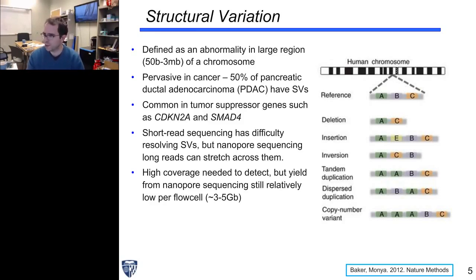Short read sequencing. So the dominant sequencing of the time of the common era is shorter reads, either through Thermo Fisher's Ion Torrent instrument or Illumina sequencing. Both of these read lengths are limited to on the order of hundreds of base pairs at the most, 2 by 300 or 400 base pair reads. This is great for detecting small mutations, but for resolving structural variations, it's kind of hard because structural variations tend to be in relatively repetitive areas of the genome, and you'd like to have a sequencing read that can stretch across the entire boundary of where you had the insertion to figure out the context of where that insertion is.